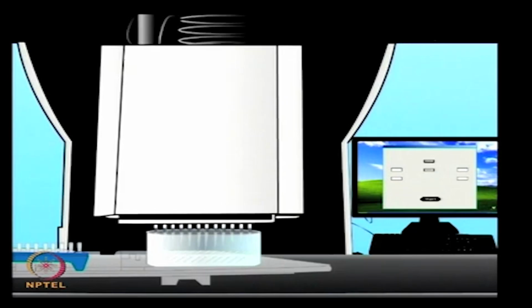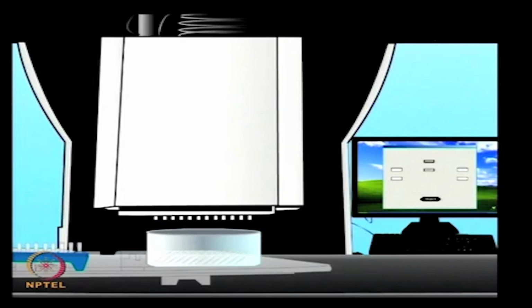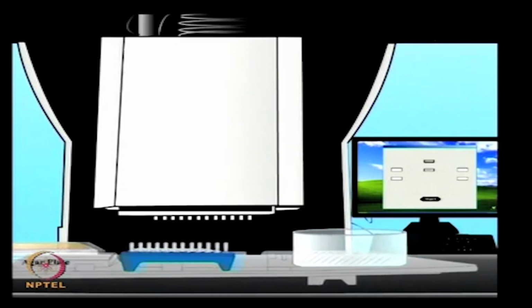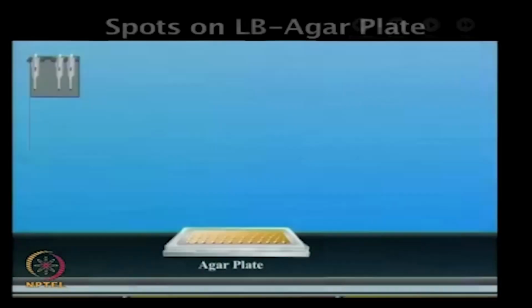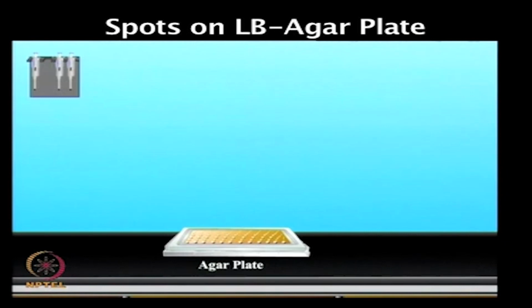It is preferred to do this in 96 well plate format, so that you can avoid any mislabeling of the samples.